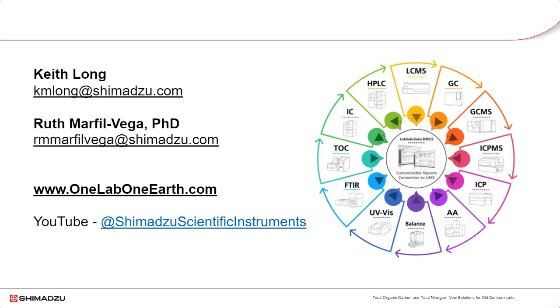There is virtually no time for sample to fall out of solution or sediment into the flow lines or the syringe. So it gives you more accurate measurements for samples that have very high sedimentation rates. It's a physical change of what the syringe is actually doing. Hopefully that helps answer that question.